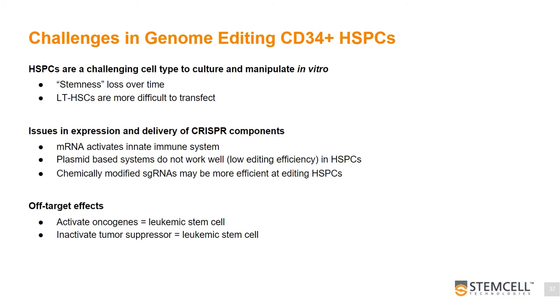There are some challenges in genome editing of CD34 hematopoietic stem cells. As Marta mentioned previously, hematopoietic stem cells are a challenging cell type to culture and manipulate in vitro due to the cells losing stemness over time. Also, several reports have recently shown that homology repair is more efficient in progenitor cells as compared to LT-HSCs. Although current investigations attempt to increase homology repair rate in LT-HSC, this is still the biggest hurdle in accelerating clinical strategy for homology repair-based genome editing for blood and immune system disorders.